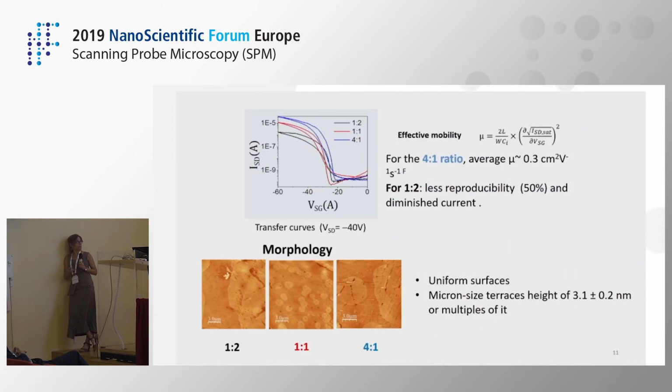So in our work, what I am presenting here, we use AFM to determine this vertically segregated structure with nanometer scale precision and for different blend ratios.